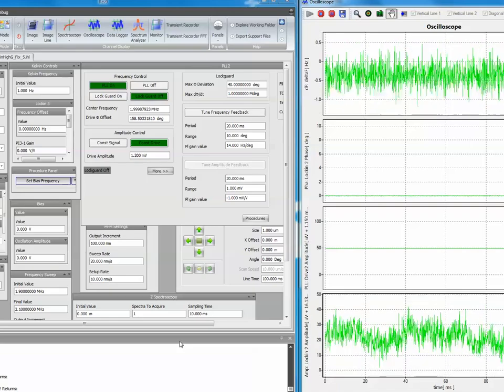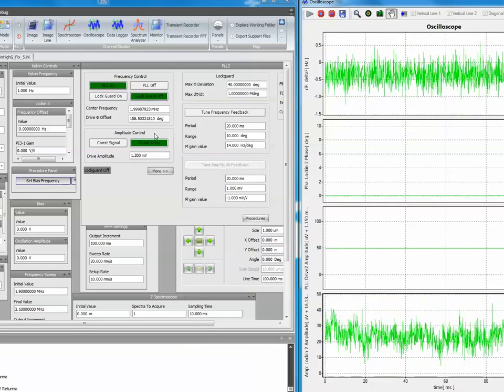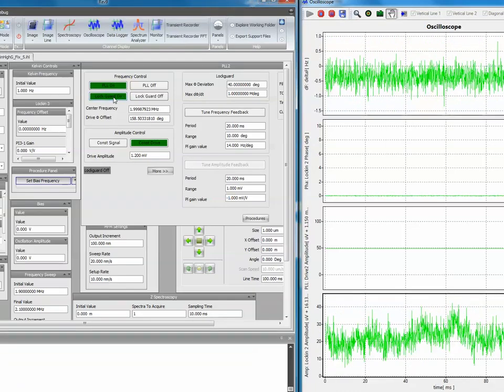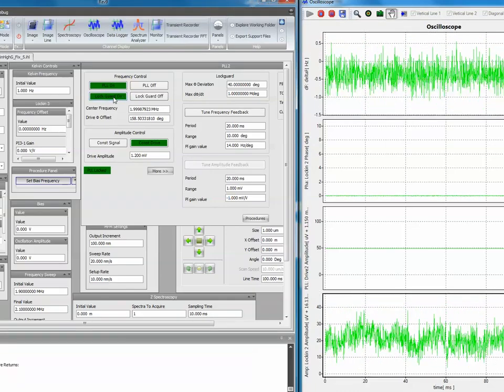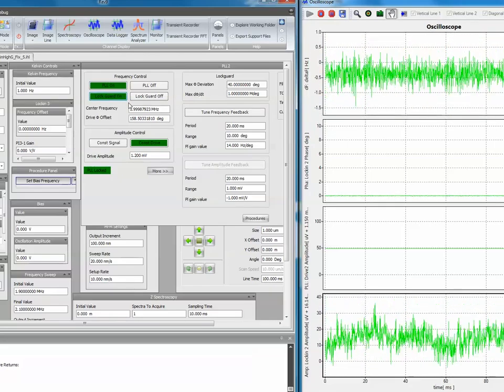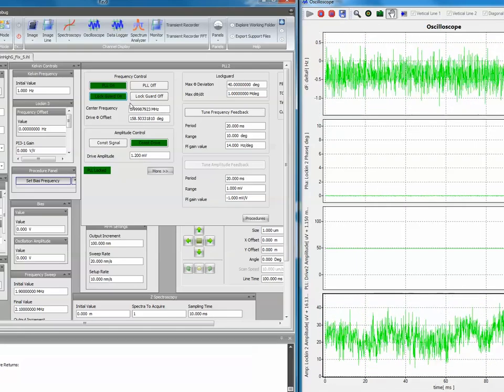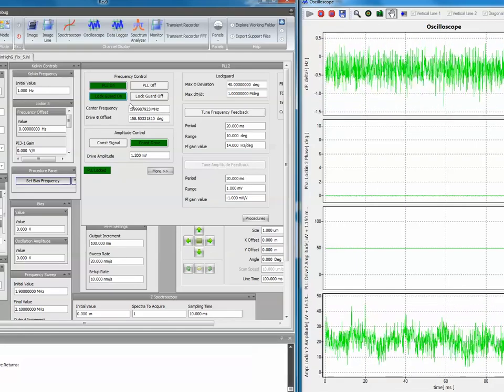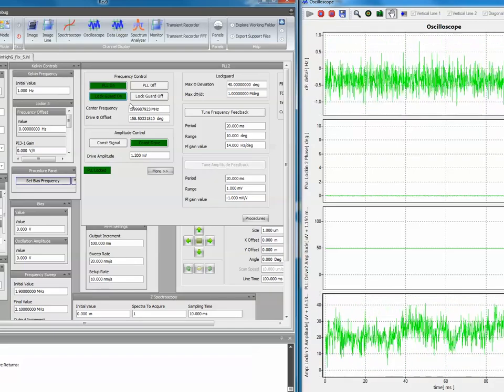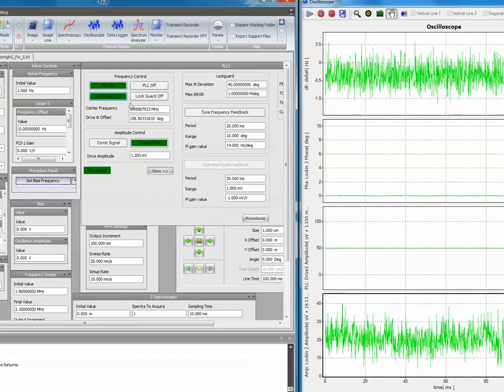The next thing we configure is the amplitude control loop. In order to do that, I strongly recommend switching the lock guard on. Lock guard protects us against an invert drive. In order to control a high Q cantilever in ultra-high vacuum, it is sometimes necessary for the amplitude control loop to actually invert the drive in order to stop ringing.